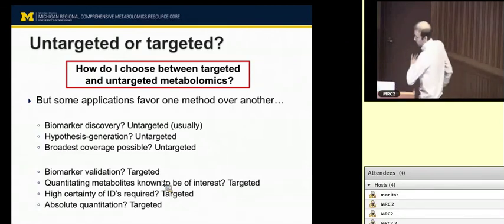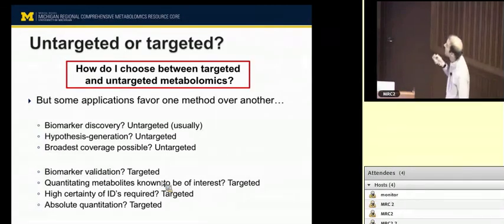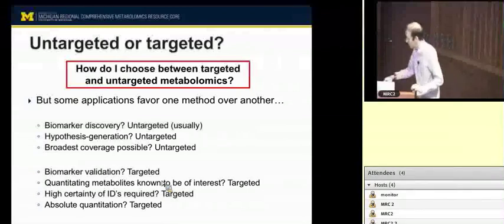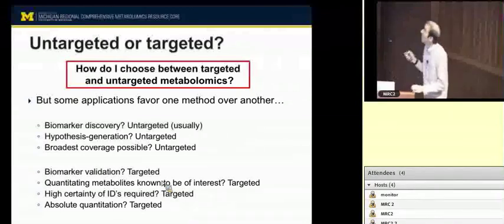Okay, one more term, which we'll talk more about tomorrow. I know I'm already over my time. Metabolomics versus fluxomics. The conventional metabolomics measures only the concentration or relative abundance of metabolites. Flux, however, the rate of turnover of metabolites, which is very dynamic, is also a really important aspect of cellular metabolism. And you can't measure flux. You might think that changes in concentration would tell you something about flux, and sometimes you would be right. But flux itself, the rate of turnover, cannot be measured by just observing how much of a particular metabolite is present. And so what is flux exactly?